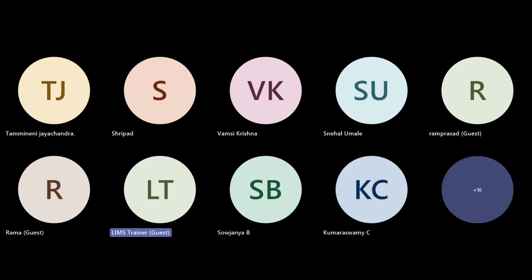Because even if you get into LabWare LIMS and do testing, you need to enter values. You need to see whether it's out of spec or not. You need to know why these two components are getting added. You need to know what variation is, what product is, what sample plan is, what item code is. Which will be covered, right? That's what I'm telling you. Even if you go for a tester role, yes, obviously it will help. 100% it will help.